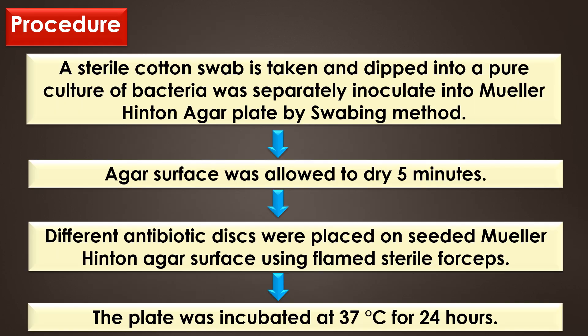A sterile cotton swab is taken and dipped into a pure culture of bacteria, then separately inoculated onto a Mueller Hinton agar plate by swabbing method — first in the horizontal direction and then in the vertical direction. The agar surface was allowed to dry for 5 minutes. After that, different antibiotic discs were placed on the seeded Mueller Hinton agar surface using flamed sterile forceps, and the plates were incubated at 37 degrees Celsius for 24 hours.